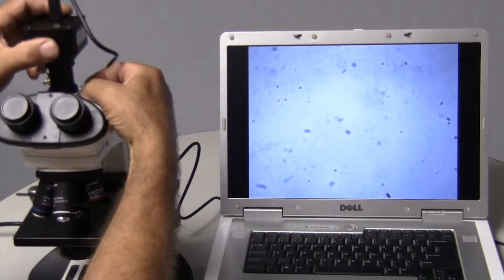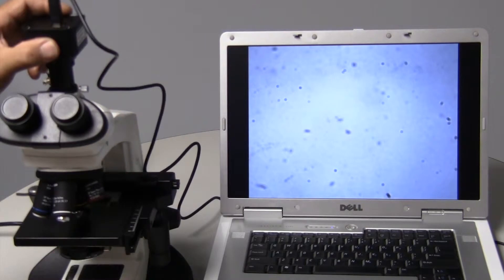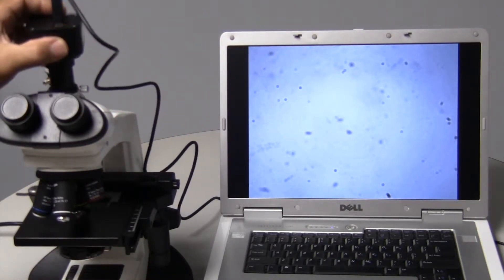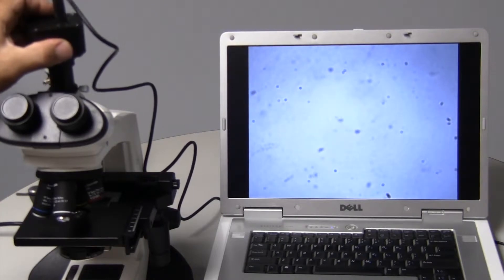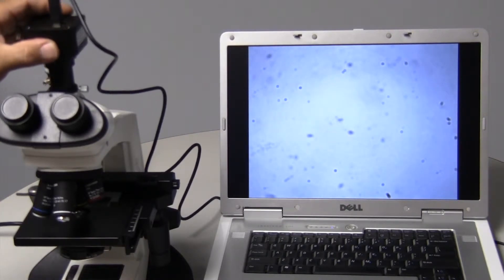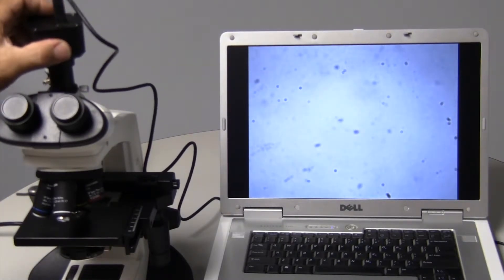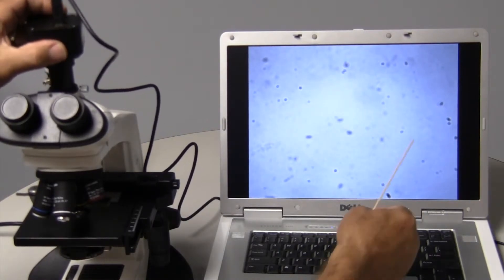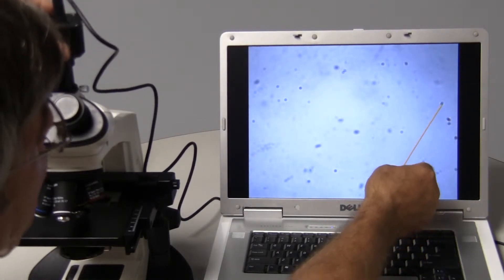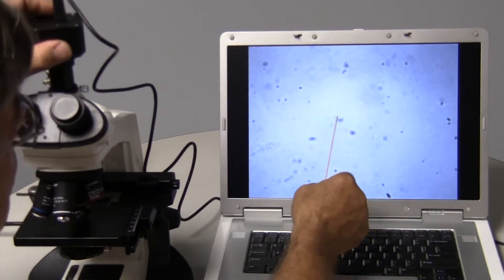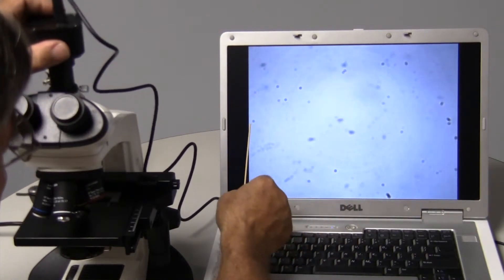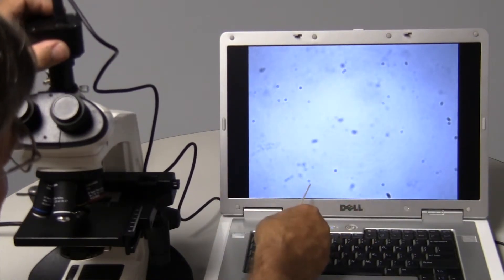Now I'm going to secure the intermediate lens, and now only move the camera, and I'm just going to rotate it. And you'll notice as I rotate it, the rest of the dirt moves, but there's still some dirt that's stationary. The dirt that's stationary, you'll notice are these pieces here, here, there's a central piece here, there's a piece here, here, here, and here.